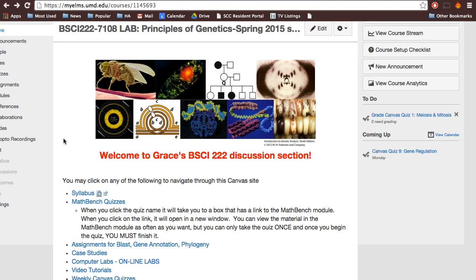Welcome to the gene annotation tutorial. I'll go over step by step how to complete this assignment. First, you can find the assignment under your TA's Canvas page under Assignments.